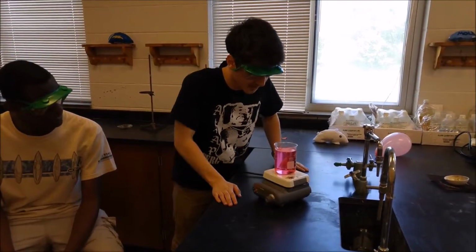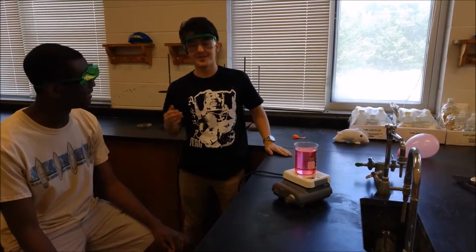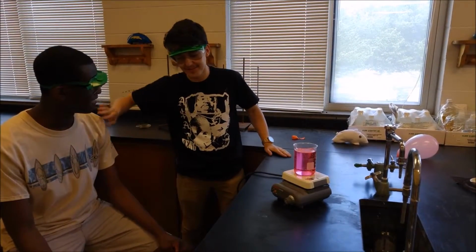I wonder if this vessel is hot enough. No, it's not safe to look into a vessel while it's being heated. Do you really think that that's an issue? Step aside.